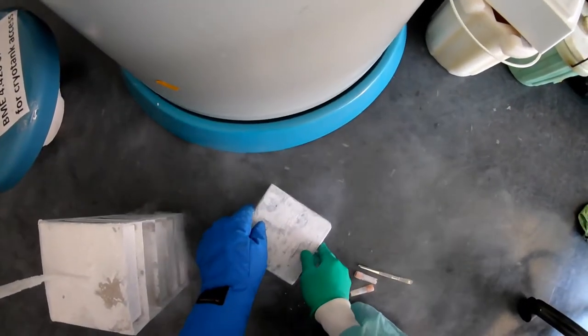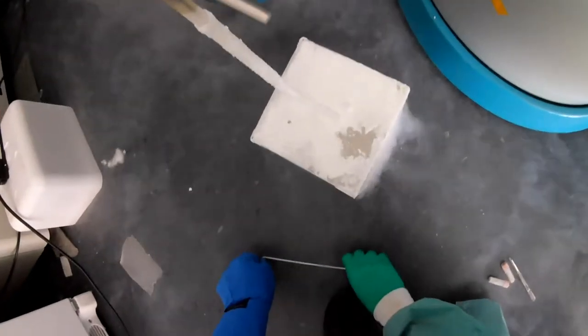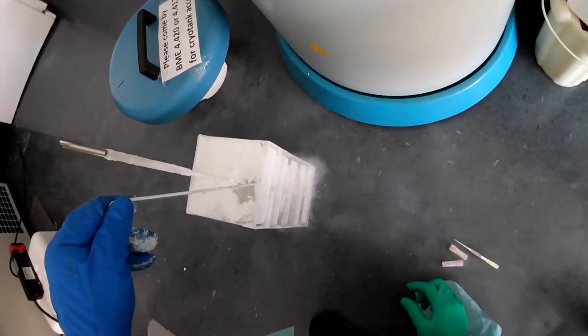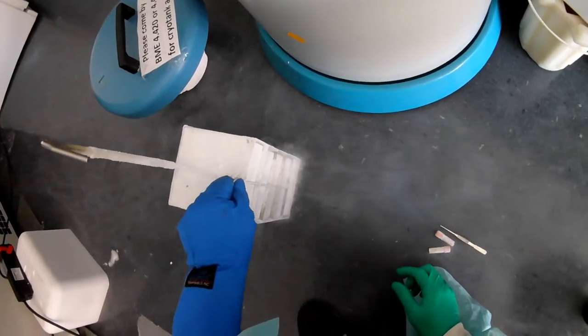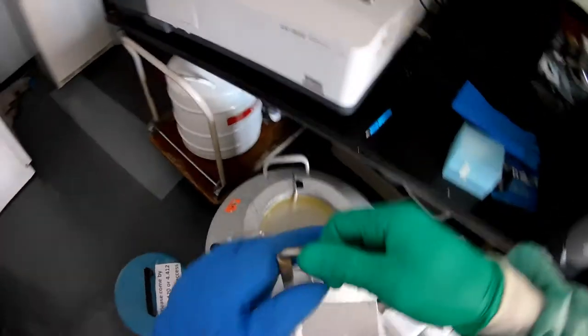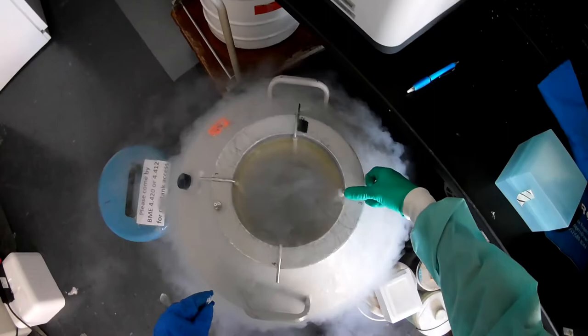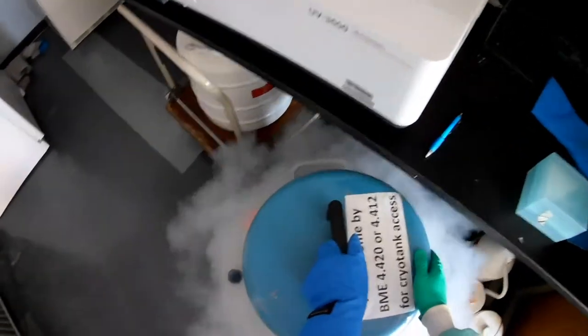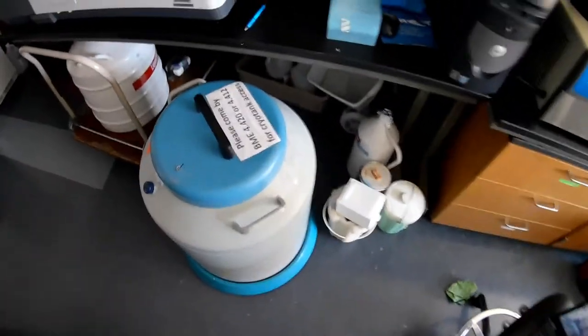So I quickly put this back, put the little lock back in here so that these boxes don't fall out. And get this back in the tank nice and quickly. All right. So that's all there is to getting your cells out for cell culture.